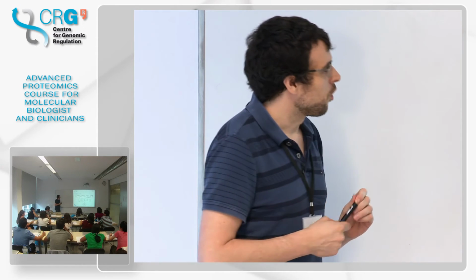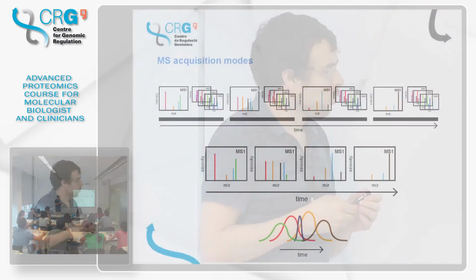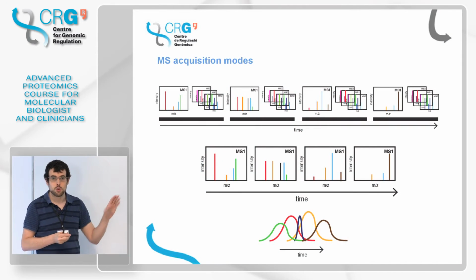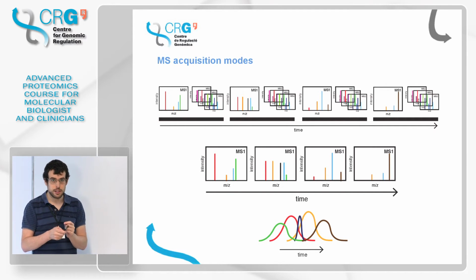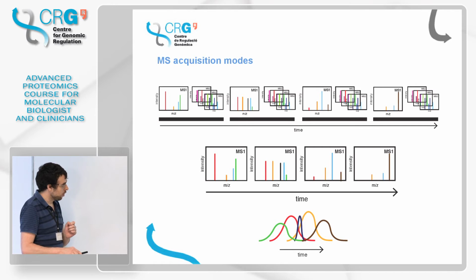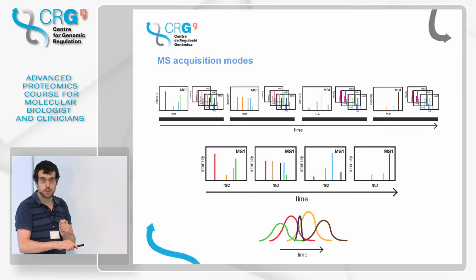So what current mass spectrometers allow us is to go to top 20 to top 30. And not only this, but with this trick of saying, well, sequence the top 3 unless it has appeared before, we can actually go quite deep in quantitation and identification.